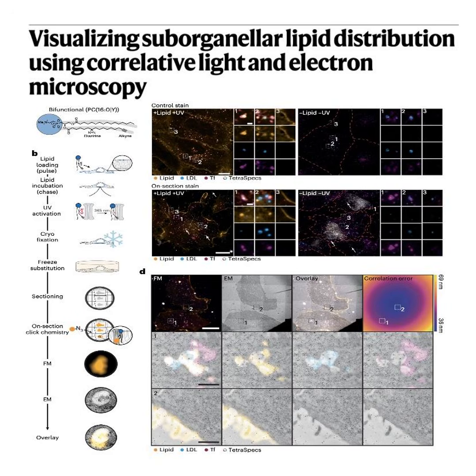I love that framing. And that brings us to the culmination of all this methodology. They took this finalized Lipid-CLEM technology and pointed it at a highly debated biological mystery. The big question: do lipids just flow passively through the cell like water, or are they actively and deliberately sorted, just like proteins? Right. And to answer this, they focused on the early endosome. Which you can basically think of as the cell's microscopic post office, right? Yeah. Molecular packages come in from the outside, and the endosome routes them to the correct department. Exactly.